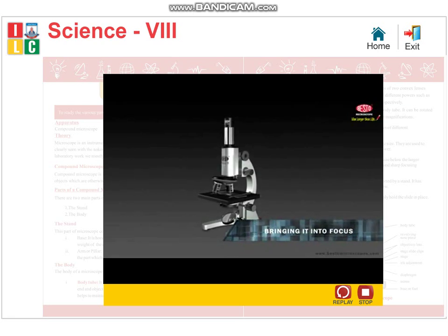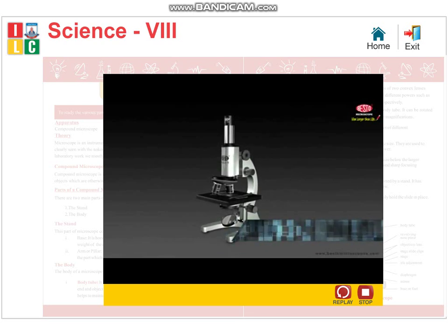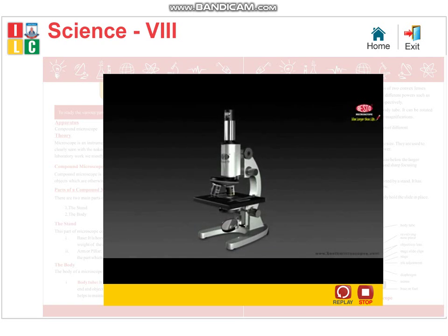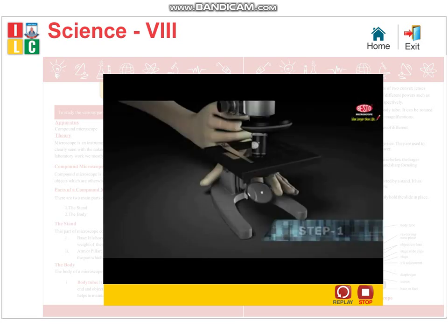You're probably anxious to get started using your microscope. Before you use your microscope, you need to know how to set it up properly. This video contains instructions for you to follow. You should come back to here each time to use your microscope until you know the instructions by heart as well as the microscope.